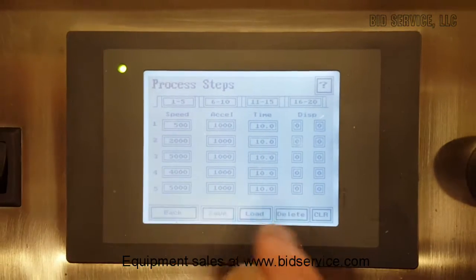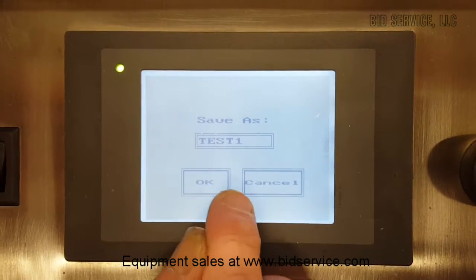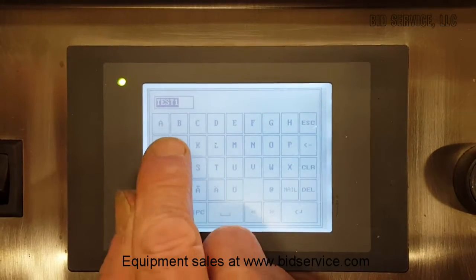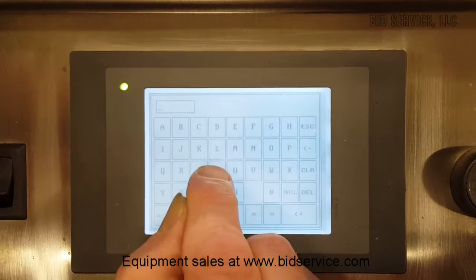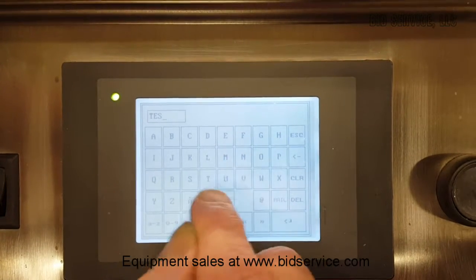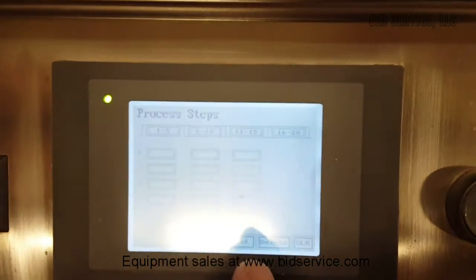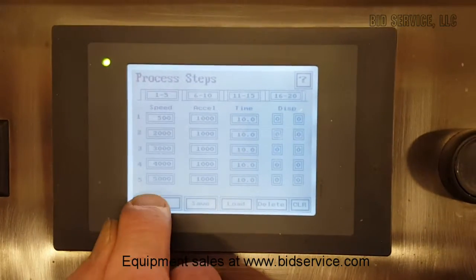Then you would save. I changed it to 500, so you'd save. You could put a new name in here if you wanted to — save as test1j, or clear and save it as testaa. So now you've made yourself a new test. Back again.